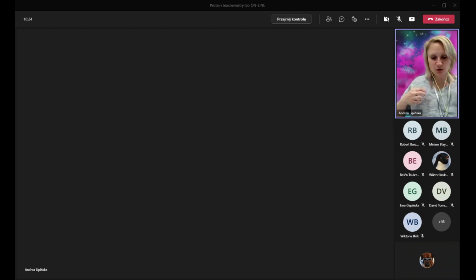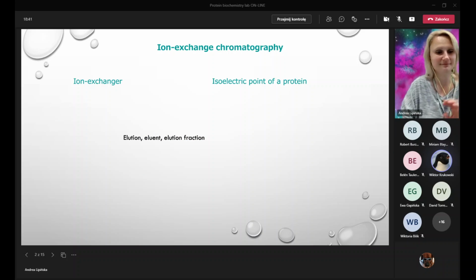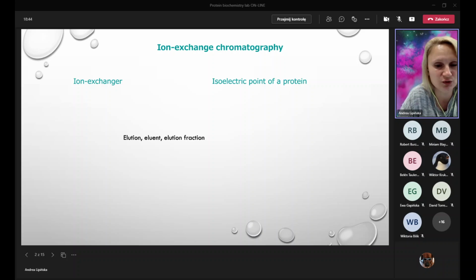Before we start, I just want to ask you whether you understand everything from your laboratory classes so far. So, do you know why we were purifying lysozyme? The first question. Because we are going to use it later for bacterial lysis. Okay. We want to use it for bacterial lysis, and I think I already told you that if you buy lysozyme commercially, we will have a commercial preparation that we can just add. We purchase it as a powder, and it says this is chicken egg lysozyme purified by CM Sephadex, exactly like you are doing.